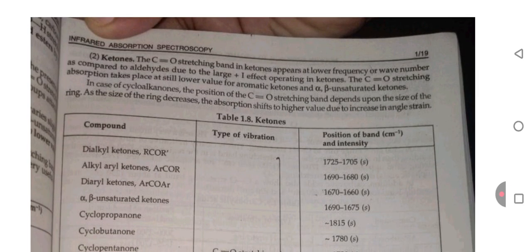Ketone. The carbon double bond oxygen stretching band in ketone appears at lower frequency or wave number as compared to aldehyde due to the larger plus I effect operating in ketone. The carbon double bond oxygen stretching absorption takes place at still lower value for aromatic ketone and alpha beta unsaturated ketone. In case of cycloalkanones, the position of the carbon double bond oxygen stretching band depends upon the size of the ring. As the size of the ring decreases, the absorption shifts to higher value due to increase in angle strain.